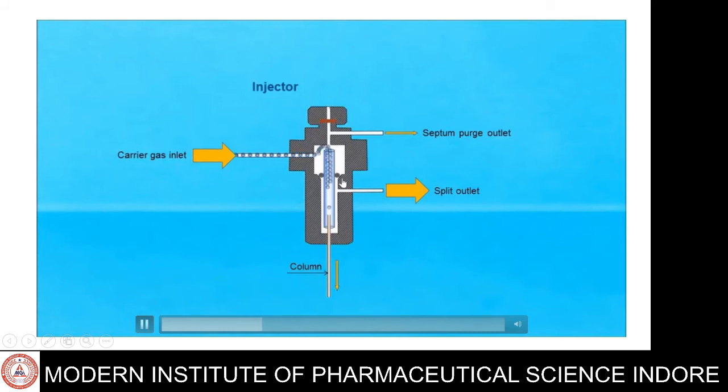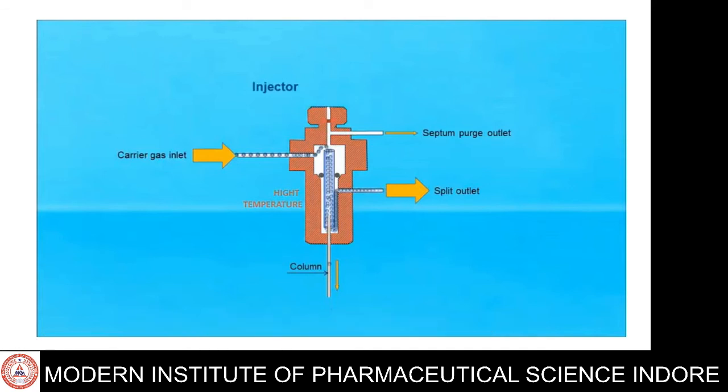The injection of the sample is considered to be a point in time, assuming the entire sample enters the gas chromatograph at the same time, so the sample must be injected quickly. The temperature is set higher than the boiling point of the components of the mixture so that the components will vaporize. The vaporized components then mix with the inert gas mobile phase to be carried to the gas chromatographic column to be separated.